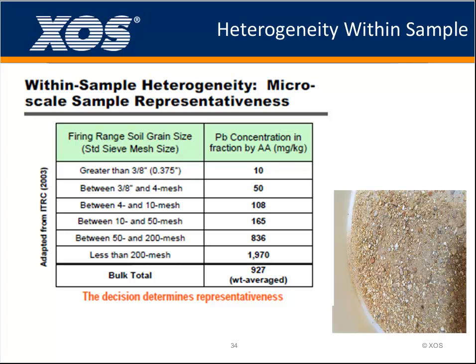And there's another influence factor. We call it heterogeneity within sample, which means different particle sizes in one sample. We can say 10-gram soil samples we get from one field. And in 10-gram samples, we separate them into different particle sizes with 4 mesh, 10 mesh, 200 mesh, and we check the concentration of lead in each particle size, and we can find the results are quite different.